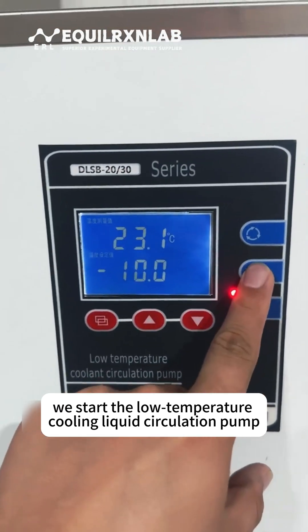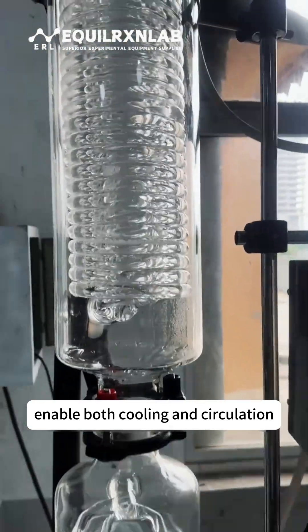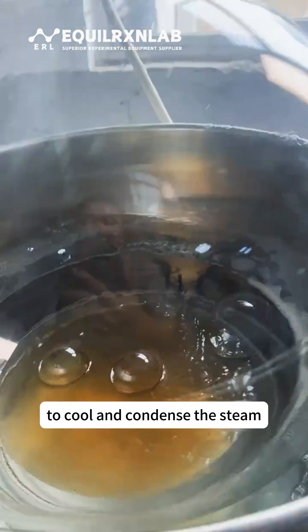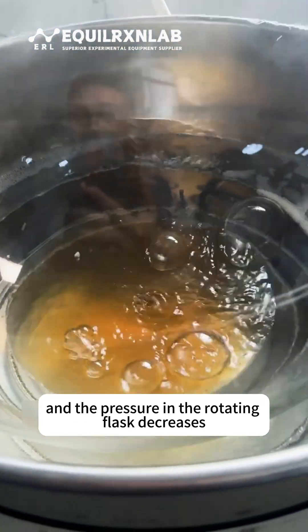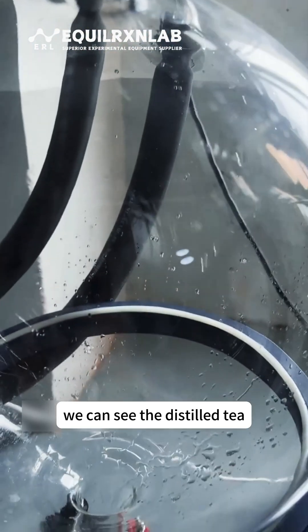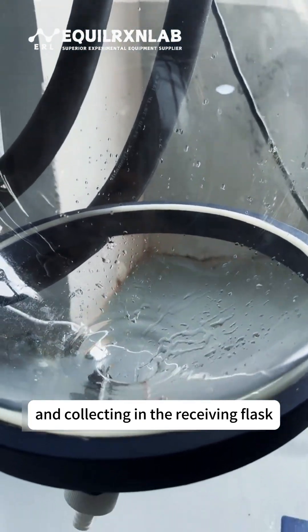Then we start the low-temperature cooling liquid circulation pump. We enable both cooling and circulation so that the coolant flows through the condenser to cool and condense the steam. As the temperature gradually rises and the pressure in the rotating flask decreases, the liquid begins to boil. At this point, we can see the distilled tea condensing again in the condenser and collecting in the receiving flask.